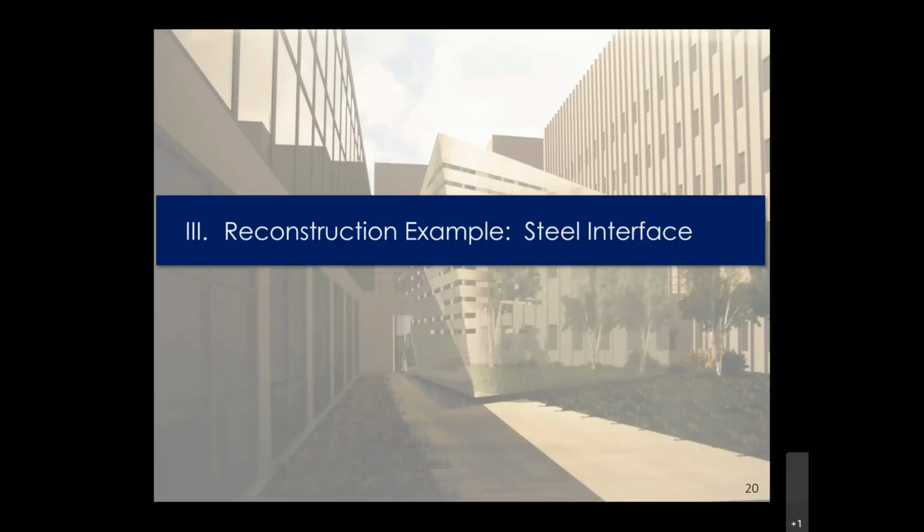And again, I can't say that CCM condones or supports or is in any way benefiting or linked with Cameca, which is the company that makes this software. It just happens to be the brand of our Atom Probe, our LEAP 4000 XHR, and then the software that we'll use accordingly with that. It's also the most common Atom Probe reconstruction software there is here.